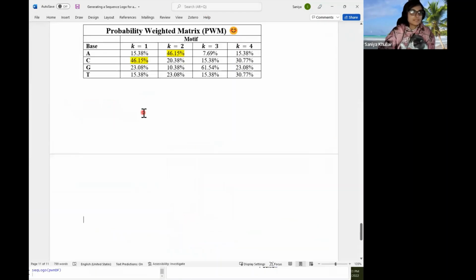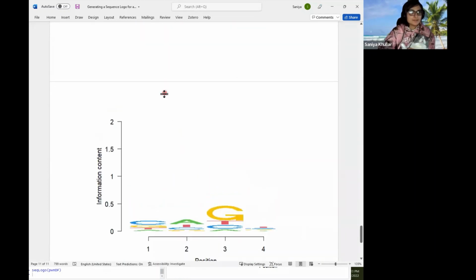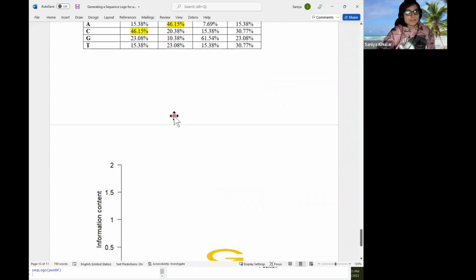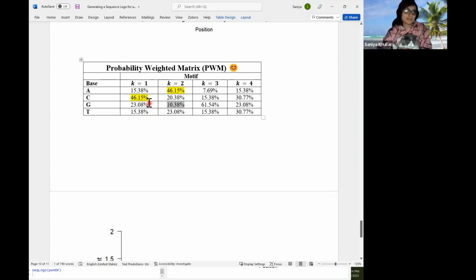So we can see that in this situation, this one is higher than this one. You can see that we went from, in the situation where they are the same, 46, 46, 15, 15, 15, 15, 23.08 here, to now having more of a three-way majority. So this one is really tiny. At least we can say that G has a really small chance of happening. Whereas here they were all kind of average, close to 23% or 15% and 46. But here we made one much smaller and can rule it out, leaving these three.